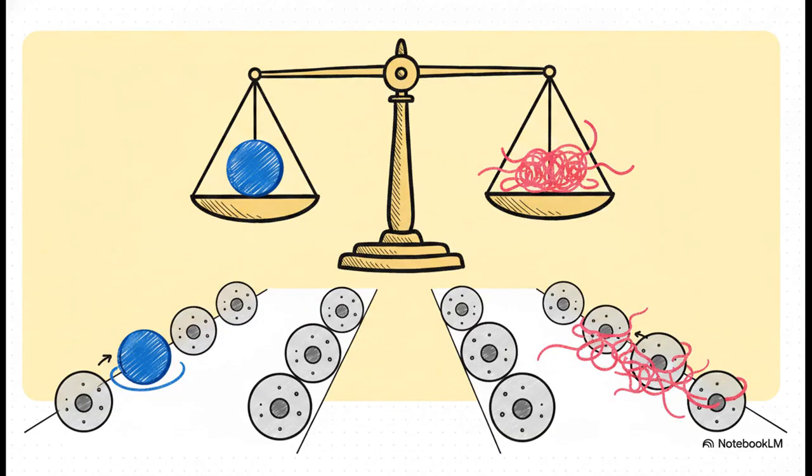But here's the catch. It's not just about their massive weight. We have to deal with the physical reality that a polymer's shape can vary drastically. Imagine two molecules and they both weigh exactly 1 million Daltons, okay? One of them is tightly coiled up, like a dense little pellet. The other is this long, sprawling, unspooled thread. Even though their mass is exactly identical, their physical volume, the actual space they take up in the liquid, is completely different. The string might get tangled up in pores that the little pellet just breezes right past, or vice versa. So you can see how this introduces a pretty major challenge for scientists who are trying to figure out mass purely based on how fast something travels through a column.